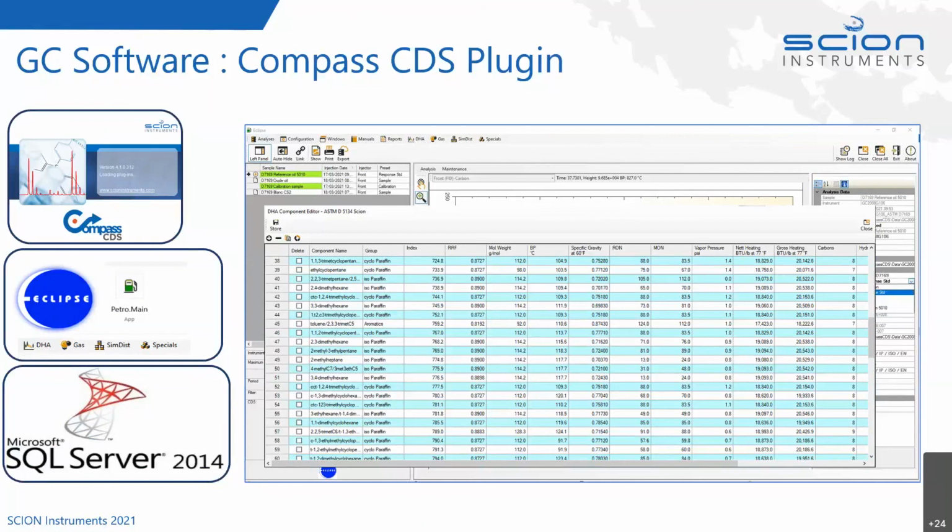We can also gear the algorithm for whether it wants to look biased towards more alkanes. So there are some other presets we can add to the search tools when it's looking up the database. And inside the database, you can see it has the boiling points, it also has specific gravities, a lot more information inside the database itself.